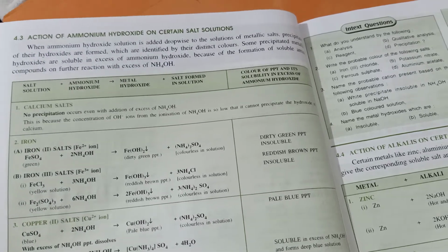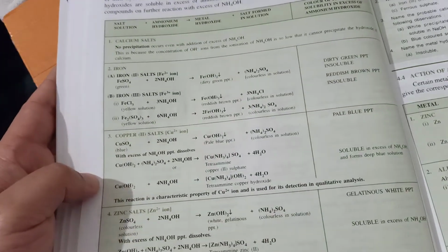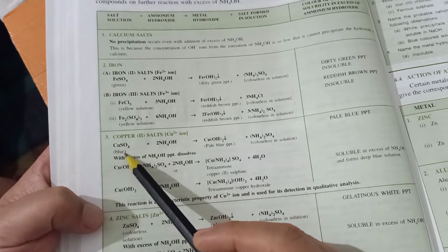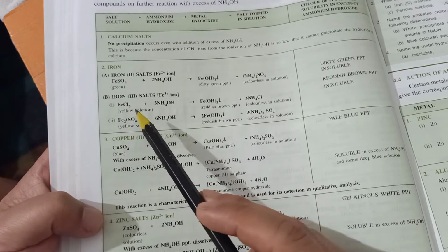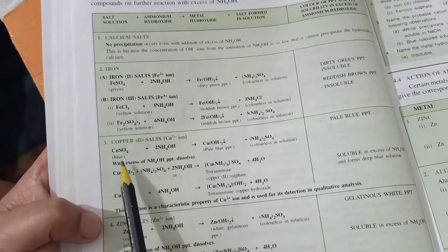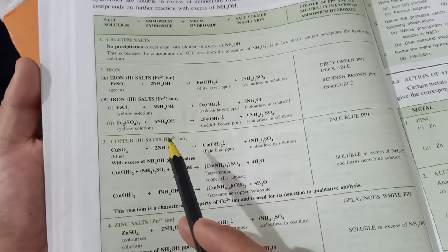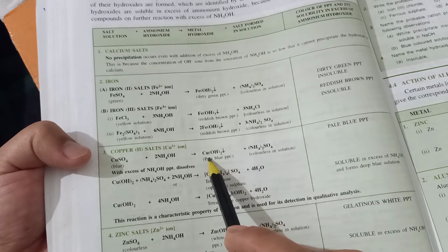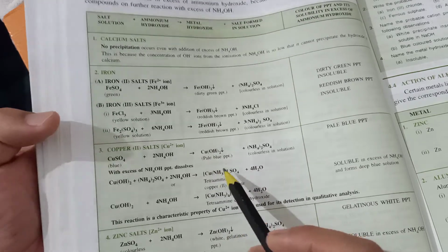Let's go to the third metallic salt, that is copper salt. Now copper salt, let's take copper sulfate, which is blue in color due to the presence of copper cation, which is blue. Now this reacts with ammonium hydroxide and undergoes a similar type of reaction as with sodium hydroxide, and therefore it will form copper 2 hydroxide, which is a pale blue precipitate.